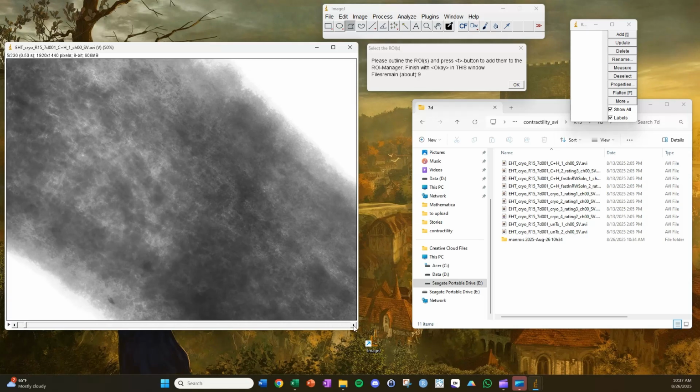Now let's go frame by frame here. And it looks like it's no longer beating anymore. Sometimes I like to keep clicking just to make sure. So yep, there is the relaxation. And now it's a phase of contraction there. So I typically go one click until I don't see any move anymore, and then another click, and that's where I draw it. So click, I saw it move, and then another click, I didn't see it move, and now I'm stopping. And then what I like to do is I draw the boundary a half cursor length within the tissue. So I'll do an example here.